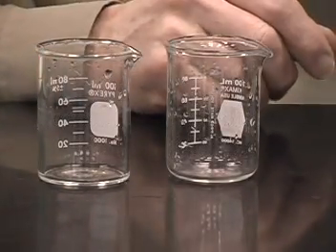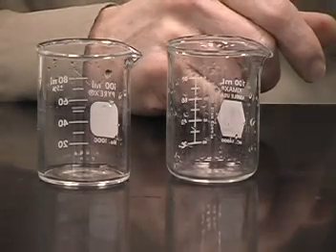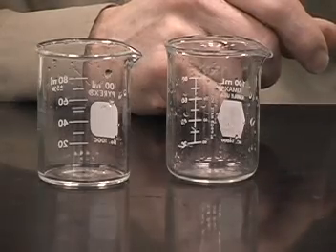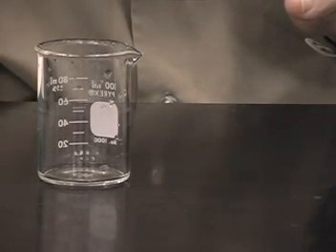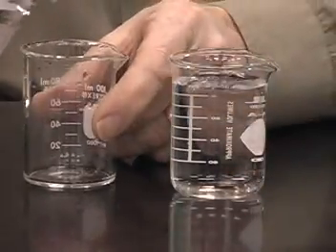Concentration units, when we deal with pollution, are often expressed in parts per million, or even parts per billion. Let me try to illustrate this with some water. I've got two 100 ml beakers here, and we'll fill them up to approximately 100 ml each.